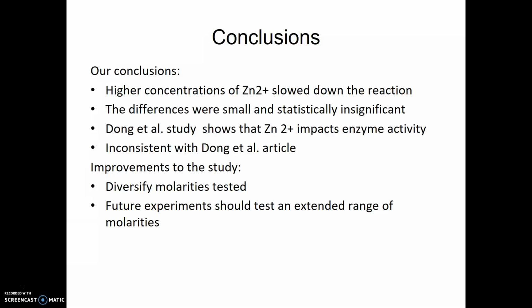We only tested 3 molarities of zinc and they were all relatively close to each other. Future experiments should increase the amount of zinc added to the solution to further examine the effects of adding zinc to the reaction.